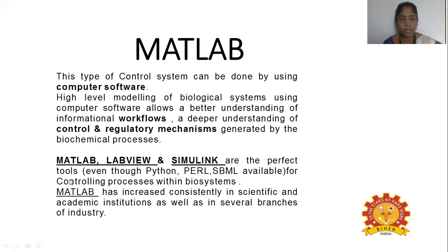As I have told you, there are various laboratory tools and computer software tools used in large scale industries for monitoring the various biochemical processes. These are the perfect tools used for controlling processes within the biosystem. We'll be looking at MATLAB and LabVIEW.